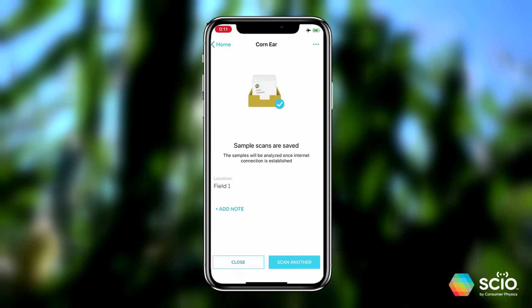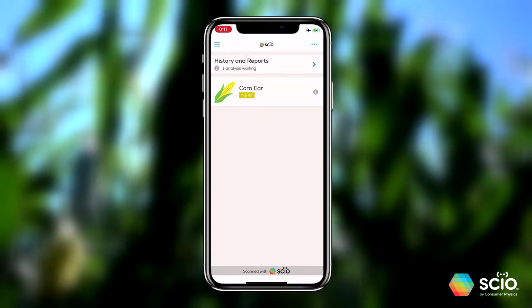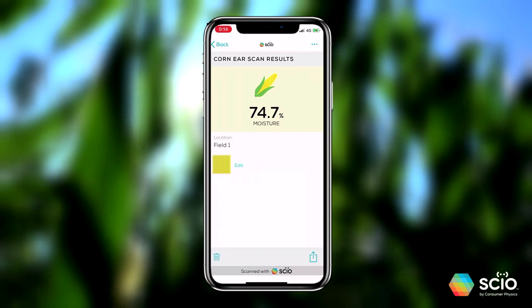If internet connection is not available, don't worry — scan seven cobs instead. It will still save the scans, and as soon as internet is back, you can click on the results screen to see the results for that field location.